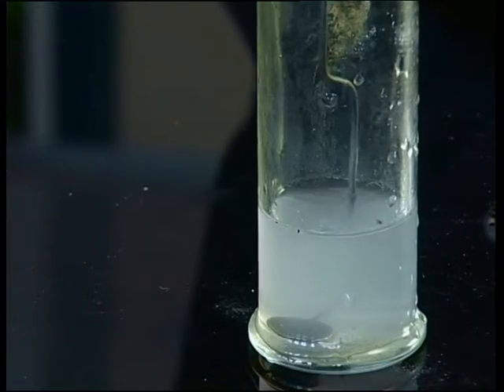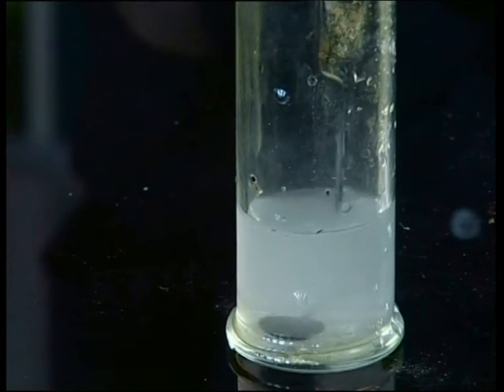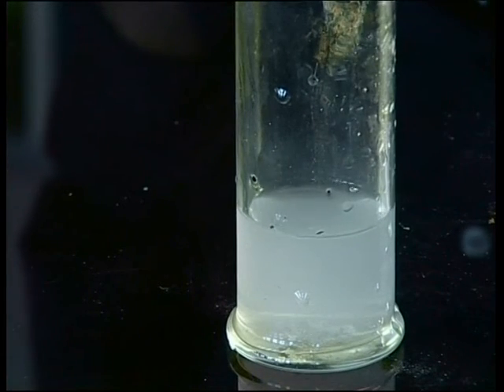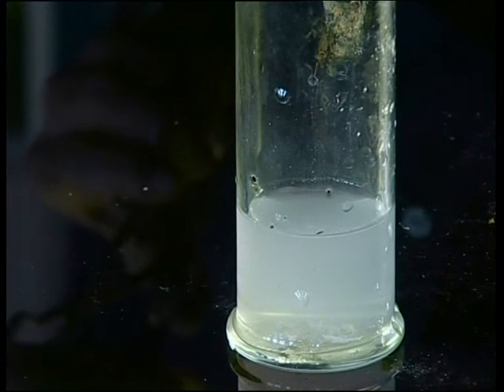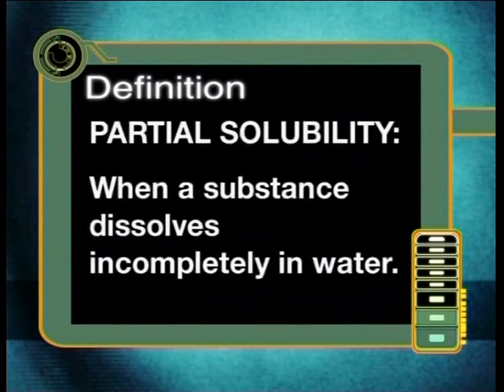When water is added to magnesium oxide, we see that the water turns a milky white. This means that only some of the solid dissolved in the water. We say that magnesium oxide is partially soluble. Partial solubility is when a substance dissolves incompletely in water. We know that magnesium oxide is partially soluble because we can see the little bits of undissolved oxide floating in the water.